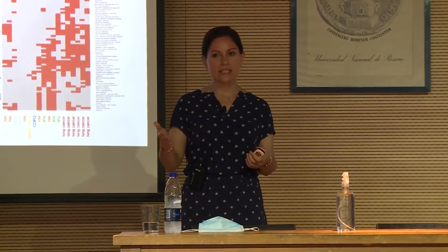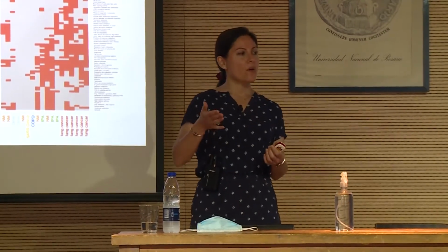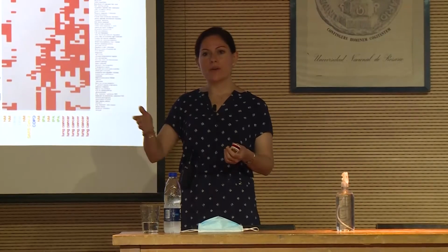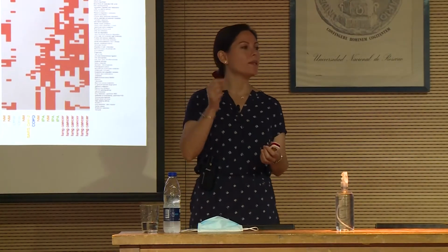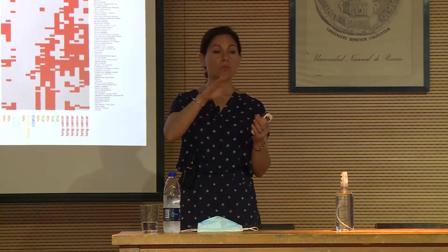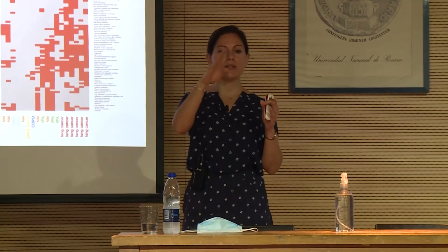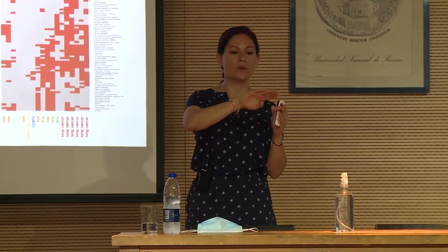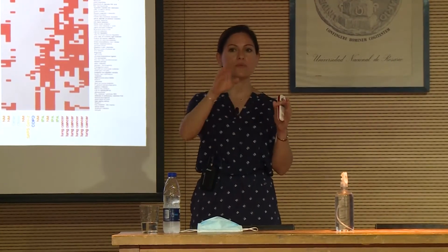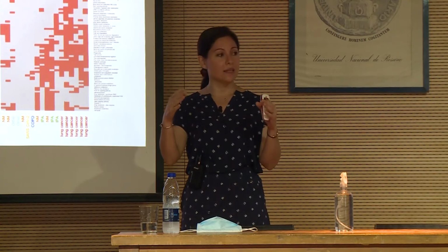But basically, it's everything that you find in Perseus. But here you have an R package that will quantify the outliers and the clusters. When you impute the values, you had a normal distribution, and then you have an additional normal distribution. The resulting distribution is still normal, still acceptable.